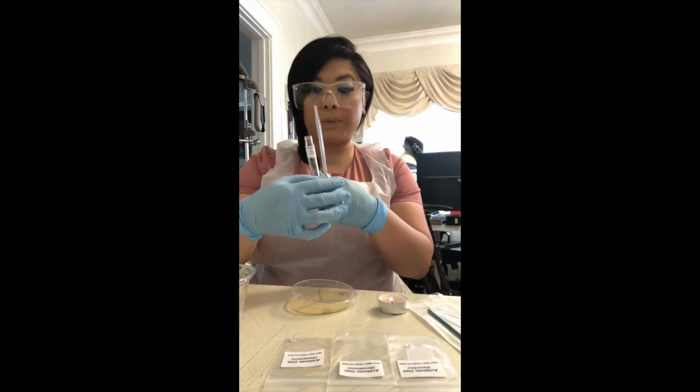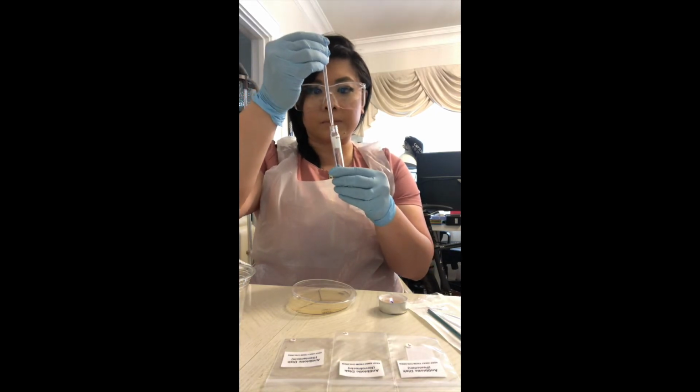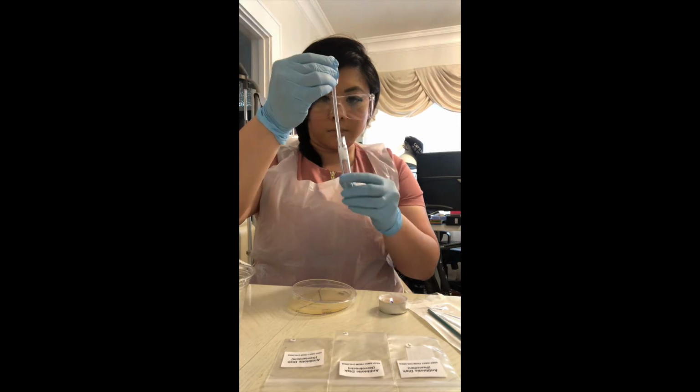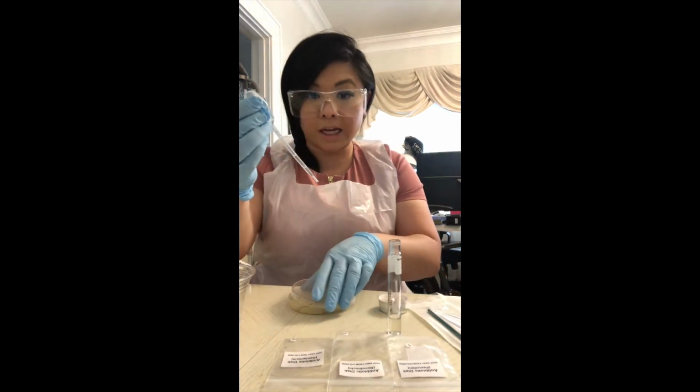Then I'm gonna collect with my pipette 0.5 ml. And then I'm gonna transfer 8 drops to my agar plate.